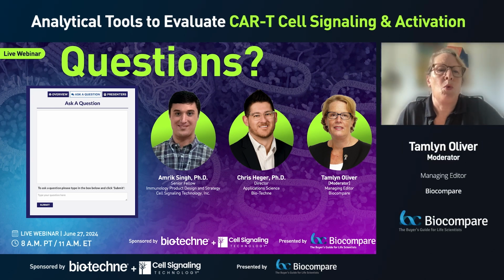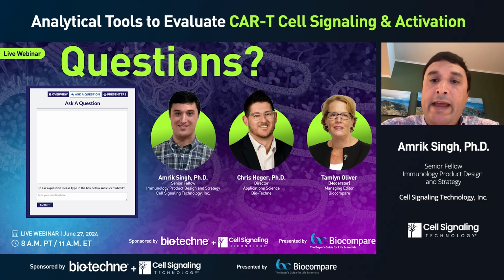Thank you. Another question, can one copy of G4S be recognized by the antibody? That's a great question. We have not tested this directly in-house, but we have heard from the field that the G4S clone that I spoke of does not recognize scFvs with one core pentapeptide. We do know for certain that it will recognize scFvs that contain 2, 3, even up to 4 repeats of the G4S sequence.